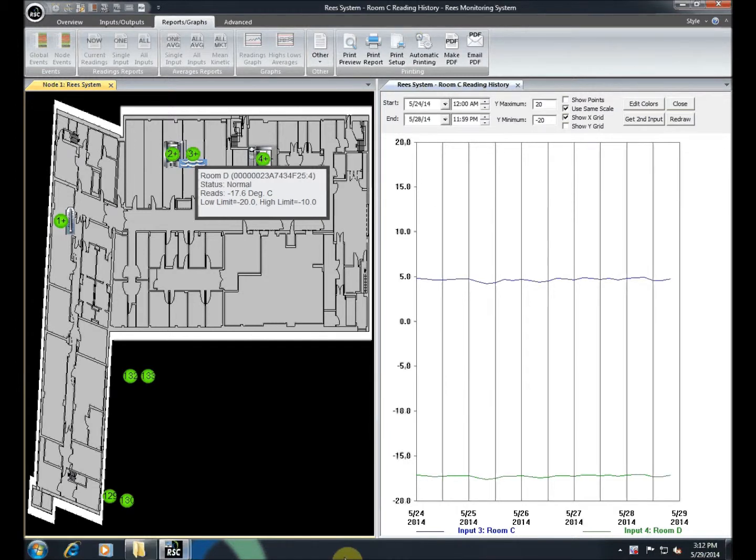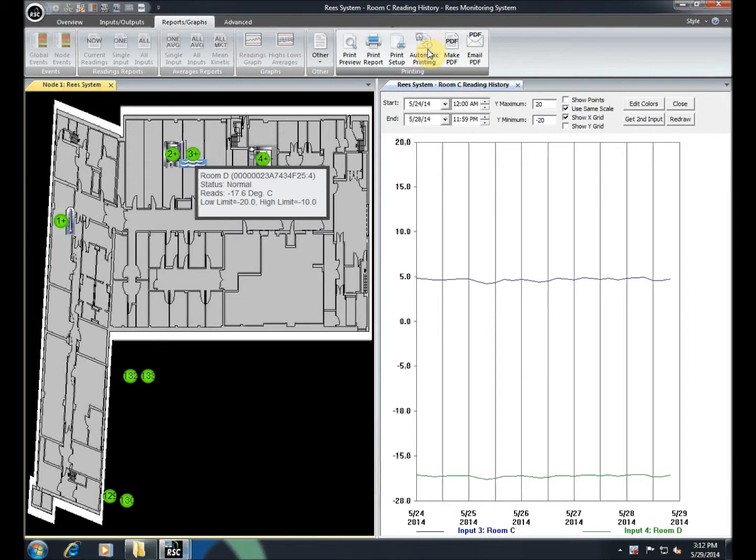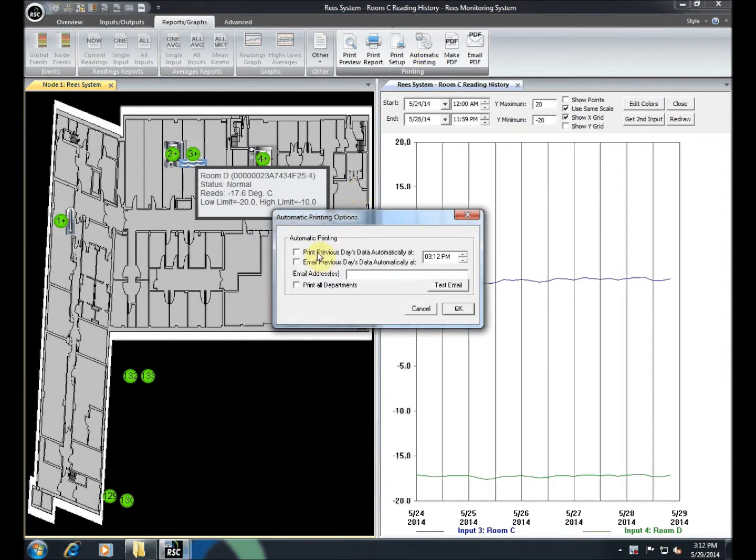The workstation also has the capability to automatically print or email the previous day's data. Just click the Automatic Printing button and enter information for your desired method of notification.